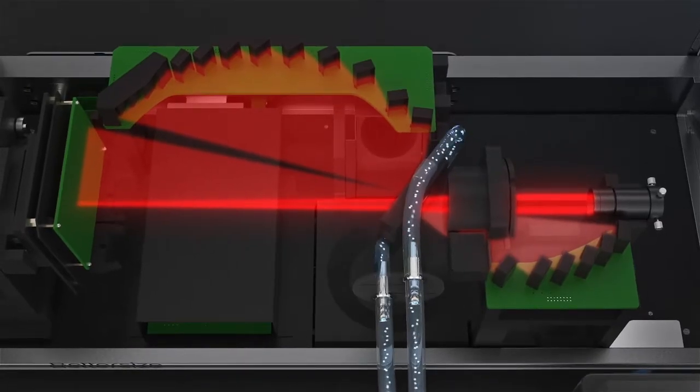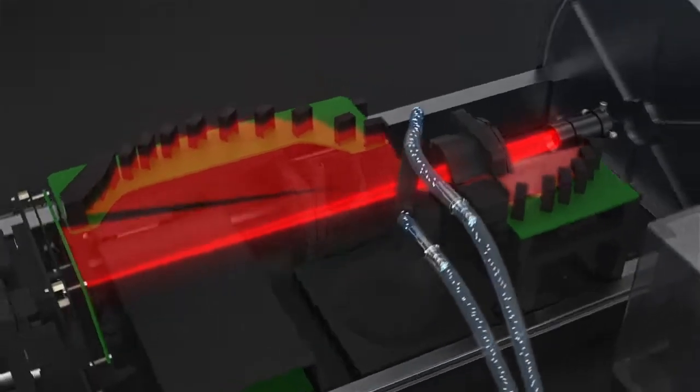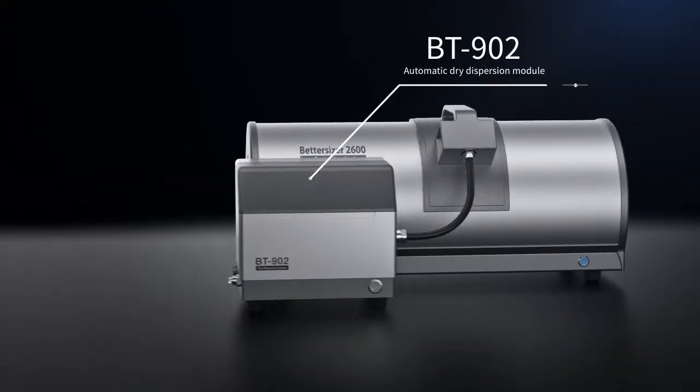The spherical detector array further ensures sizing accuracy. With the help of the BT-902 automatic dry dispersion module, particle size measurements are easy and reliable without the use of solvent.